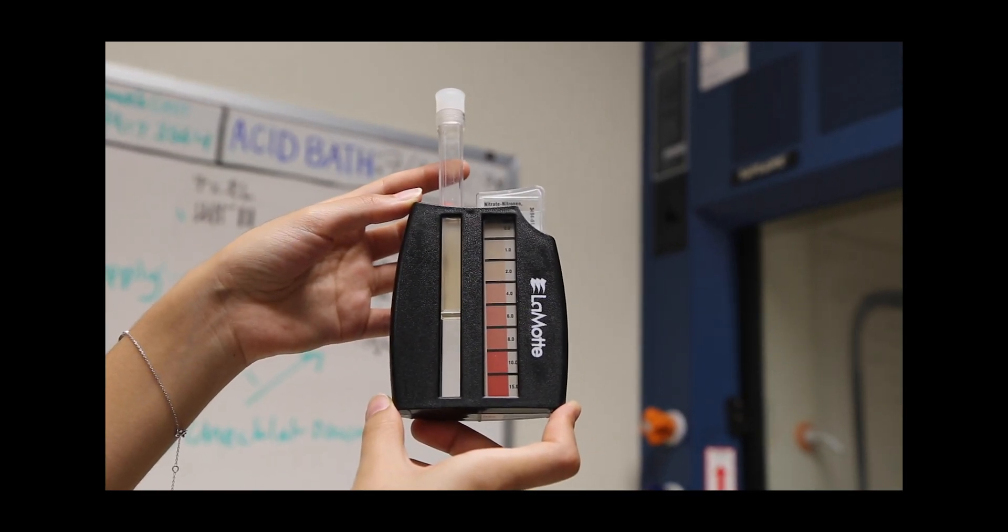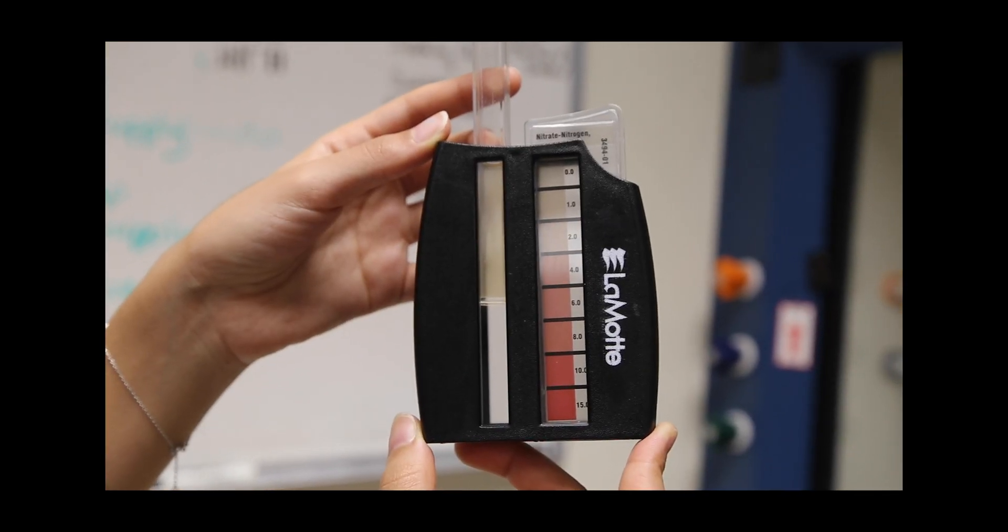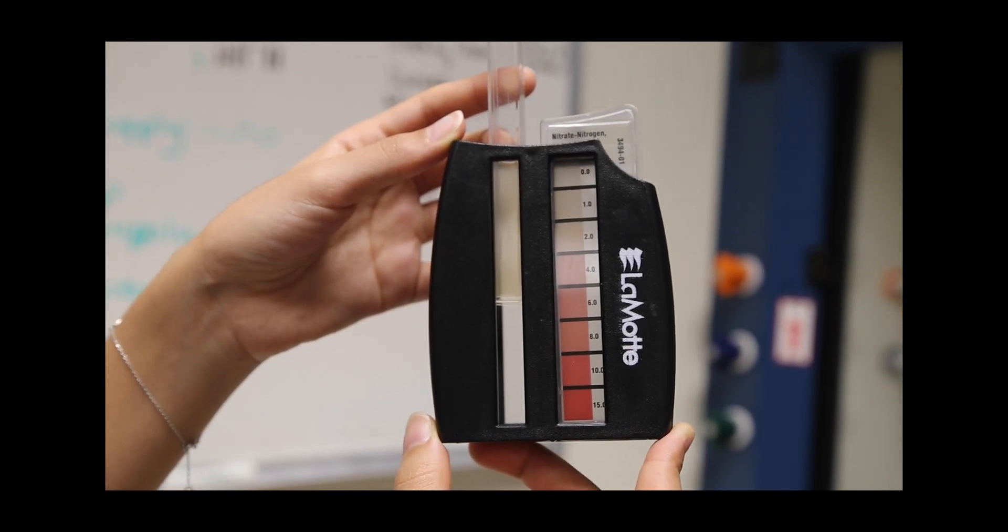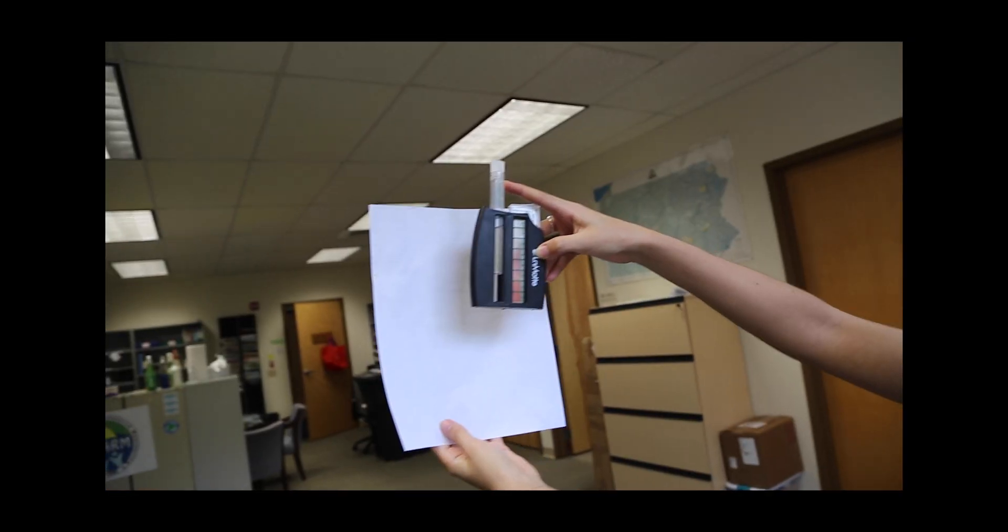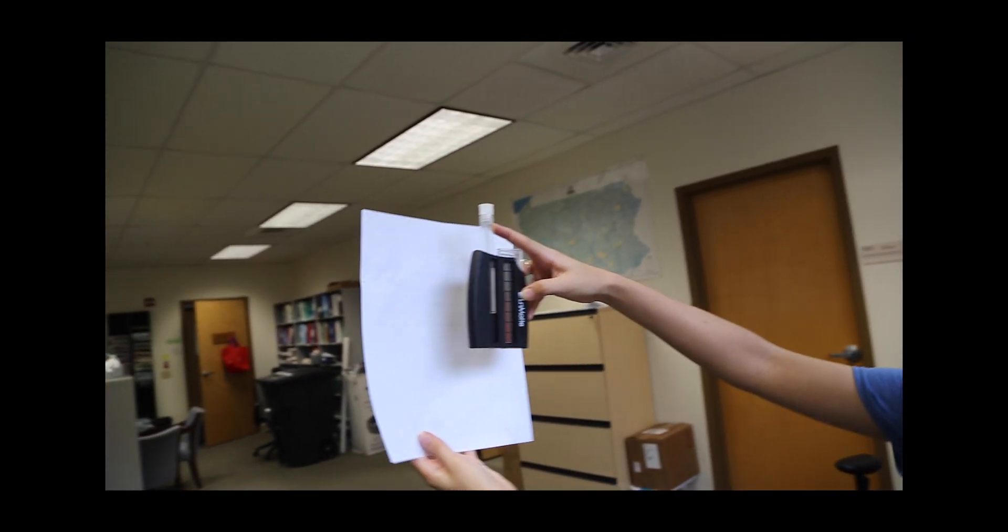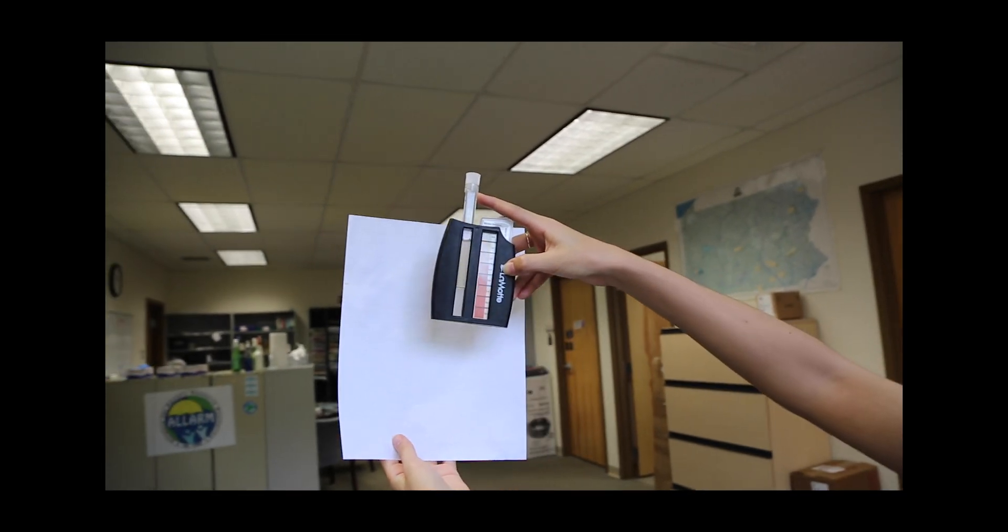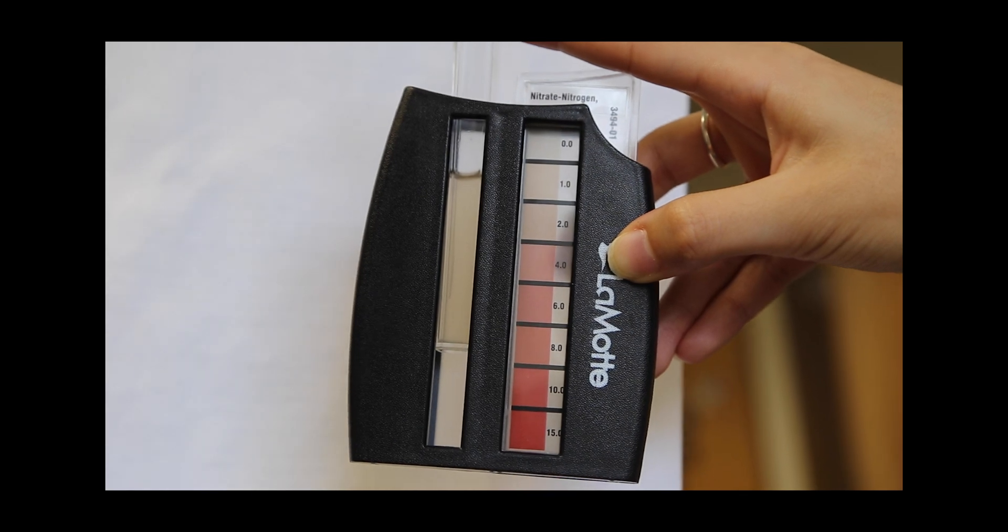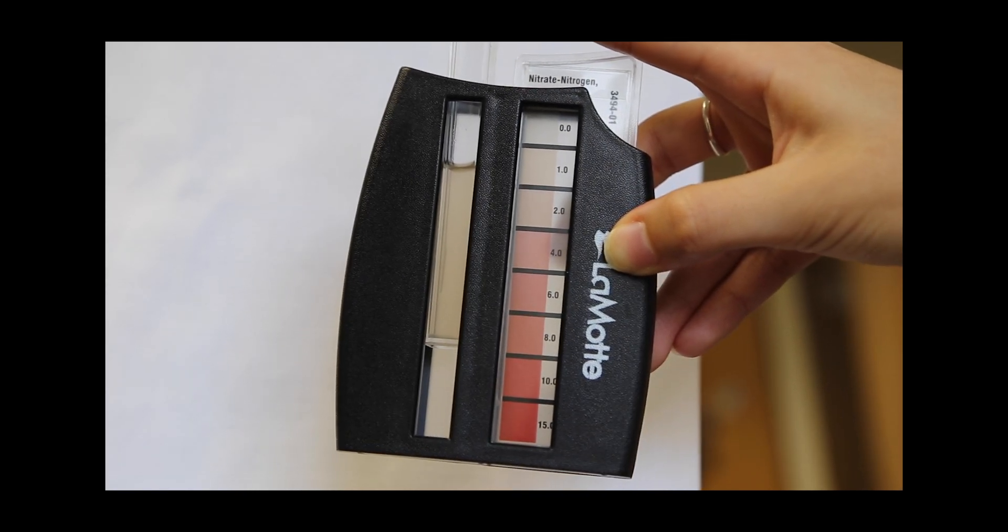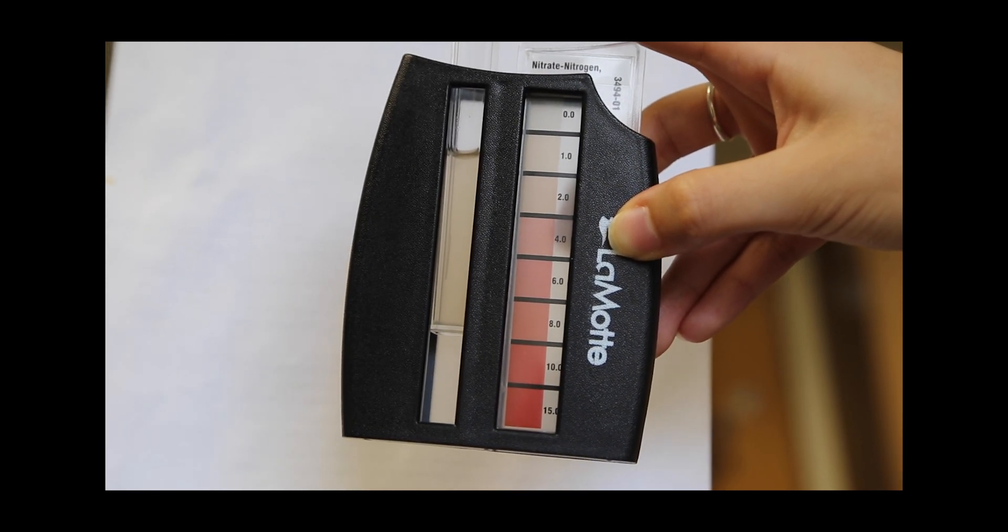Now that you have let your sample sit for 5 minutes, insert one test tube into the OctiSlide Color Range Viewer. Hold the viewer about 1 foot in front of a white colored background and have a good light source above and behind the back of the viewer. You can also hold a white sheet of paper about 1 foot from the OctiSlide viewer for another source of light.